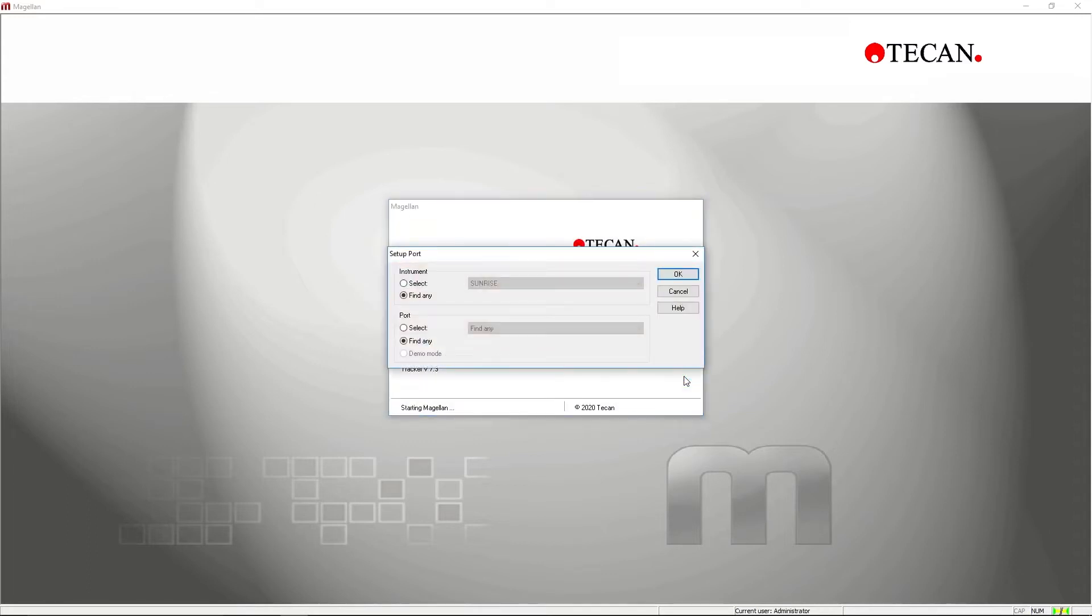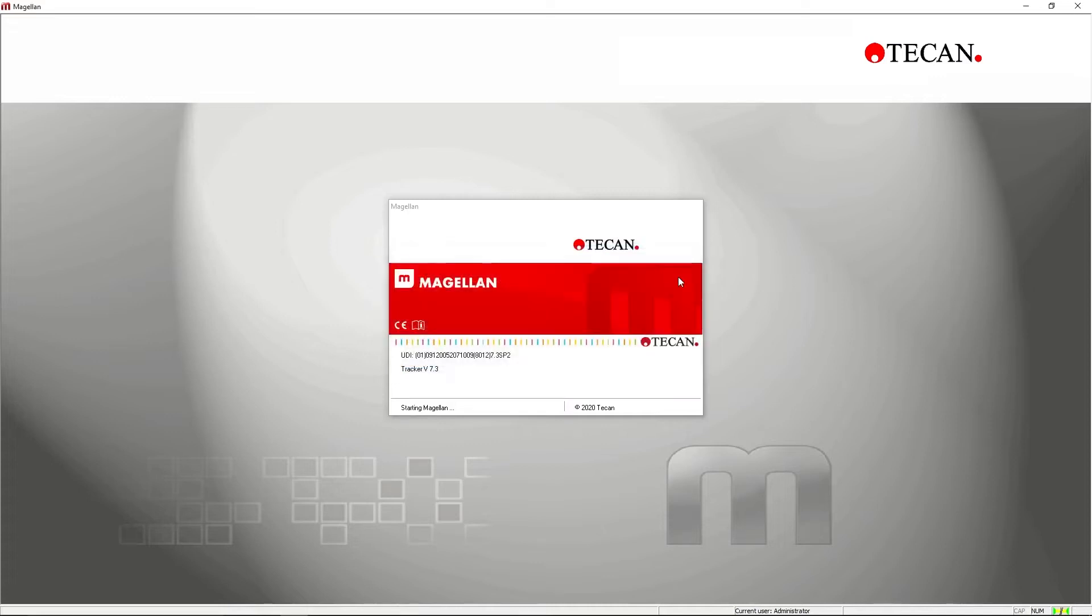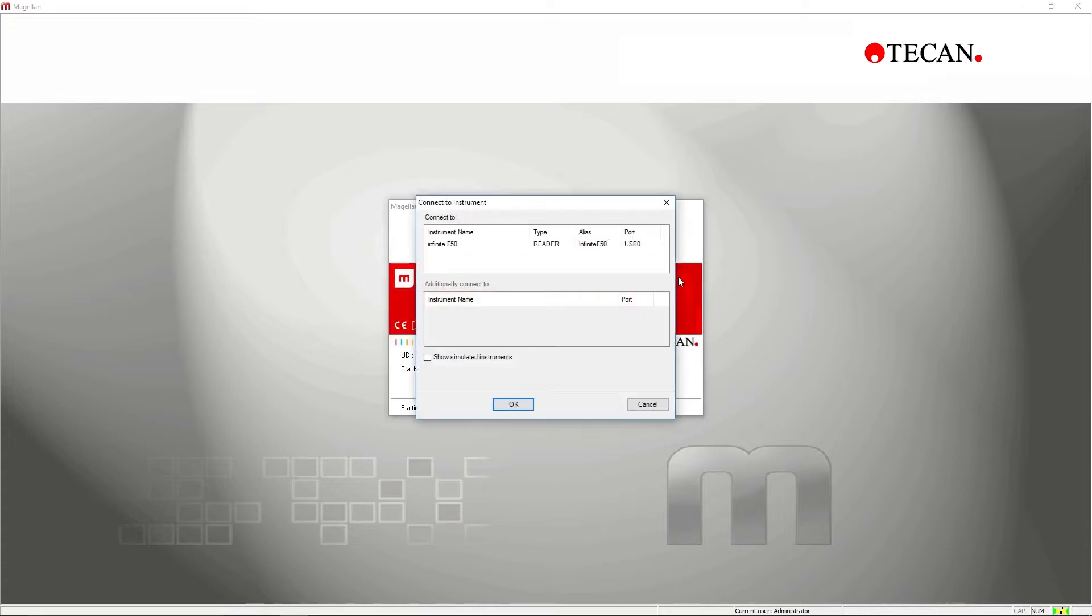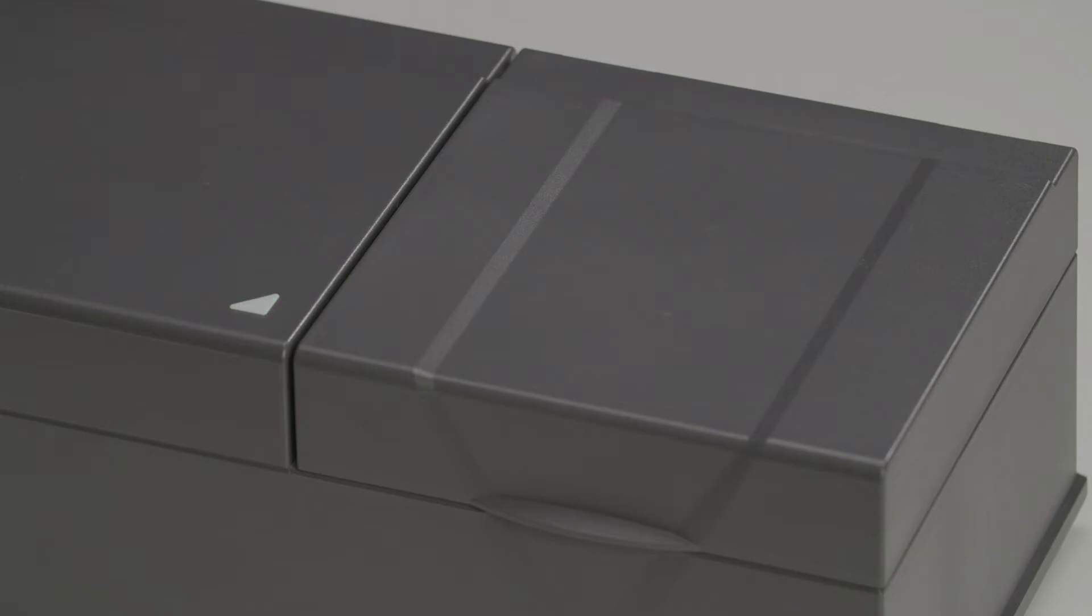You are now ready to connect Magellan software to your Infinity F50. When the green light stops blinking, the device is successfully connected.